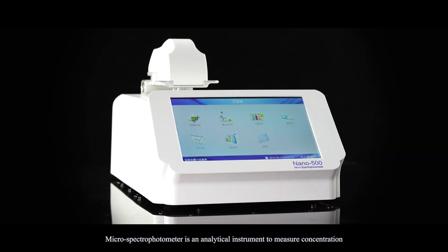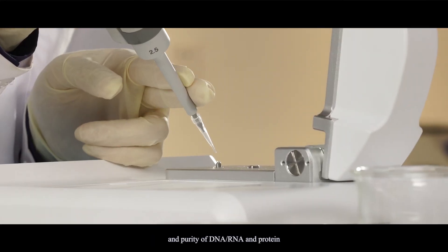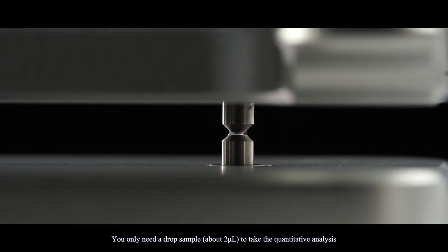A microspectrophotometer is an analytical instrument to measure concentration and purity of DNA, RNA, and protein. You only need a drop sample about 2 microliters to take the quantitative analysis.